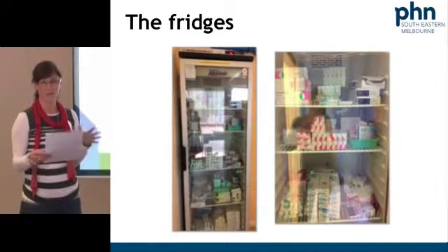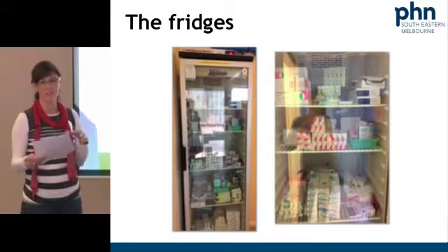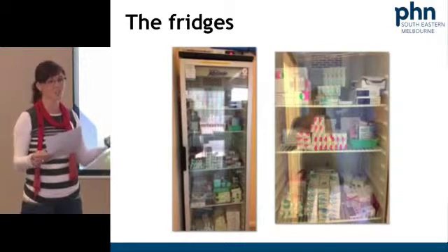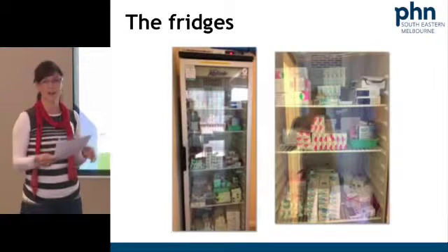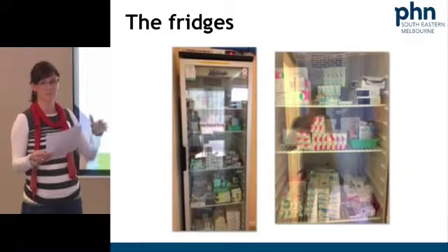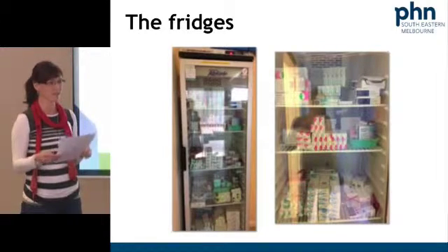So we were very bemused and baffled as to why this year we were given a certificate of non-compliance, whereas last year he spent the same time, I was there when he came and worked on the fridges, tested the upper, middle and lower shelving, and all he did was recalibrate the ranges.